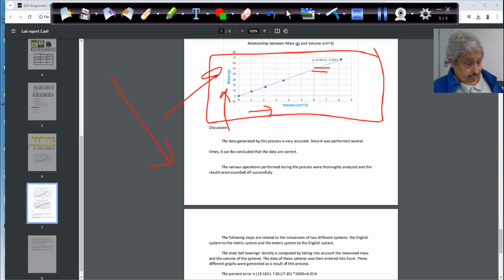Yes. So, the last lab report, it didn't matter if you labeled it. This one is very important because this one is a ratio of a real object. That one we don't know about. The first lab, we just had a couple of data points and we plotted them, as we didn't know what we were dealing with. Here we know what that is. That's stainless steel.